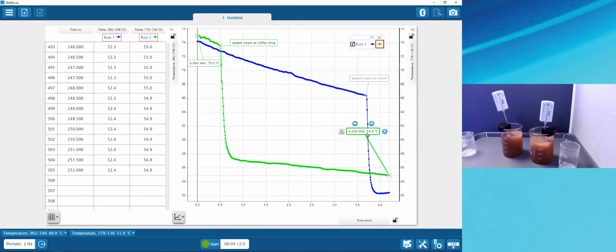I'm going to remove this second coordinates tool and focus our attention on the leftmost coordinates tool here. If I click on the label and release, you'll notice that besides the nudging arrows, it has a tool built in that looks like the Greek letter delta. This may remind you of change, delta for change. If I click on the delta tool, I'm given a second handle for my coordinates tool, and I can drag it out and drop it on any point.